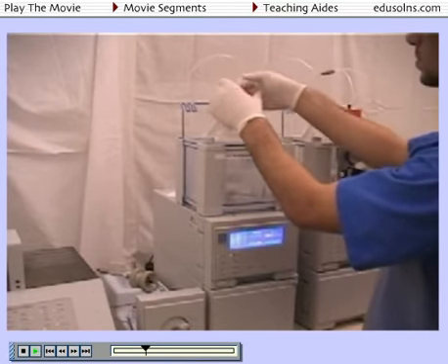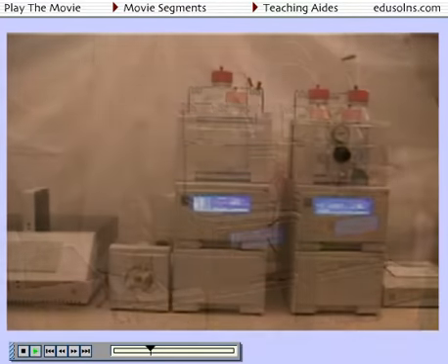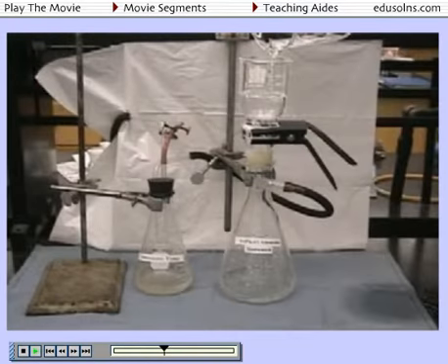There are 4 basic steps to start the typical HPLC. Turn on all power switches. On the Dynex DX500, there are separate switches on the auto-injector, pump, detector, interface box, and the computer. Next, the solvent must be filtered as shown in an earlier demonstration, placed in the solvent reservoir holder, and degassed with the helium. Then the pump must be primed.